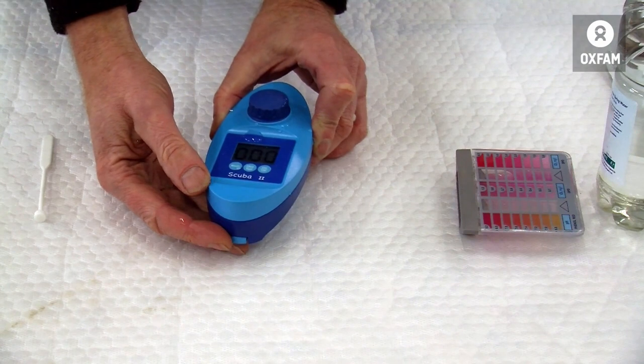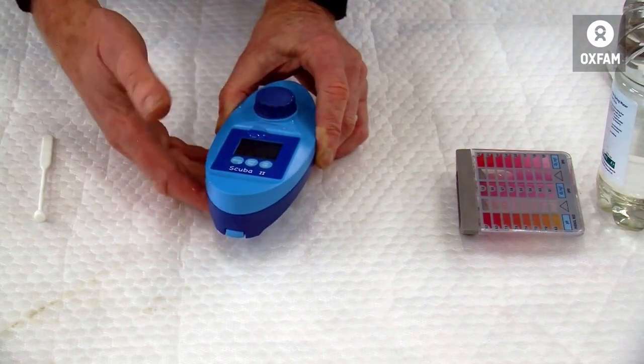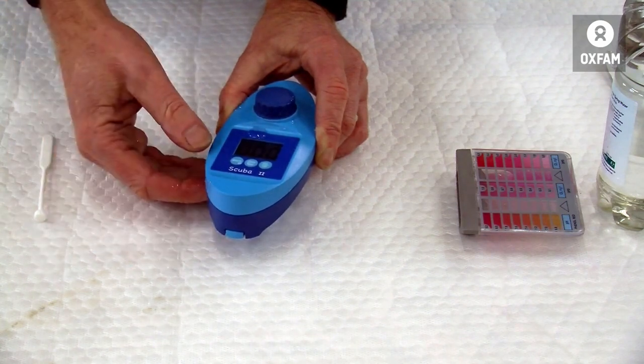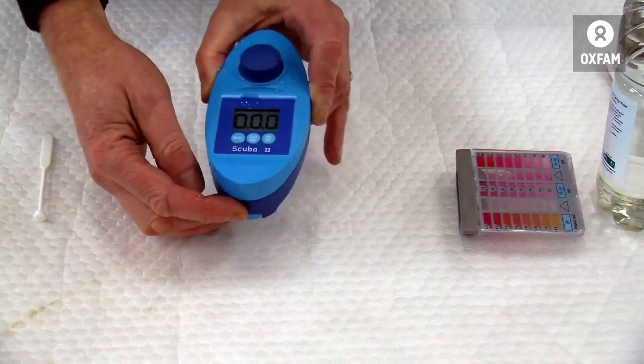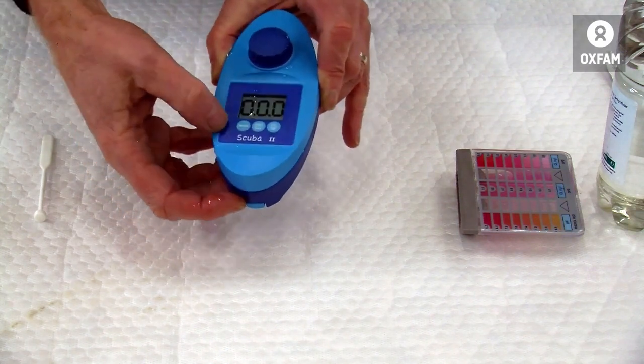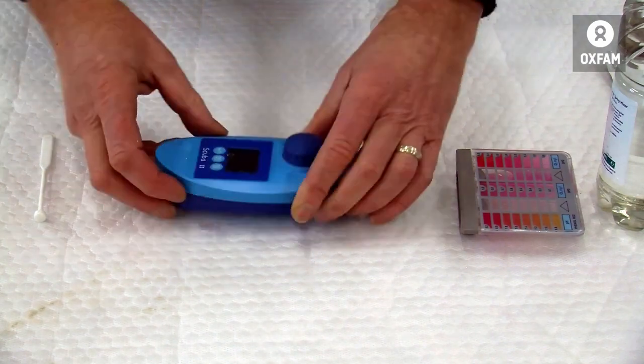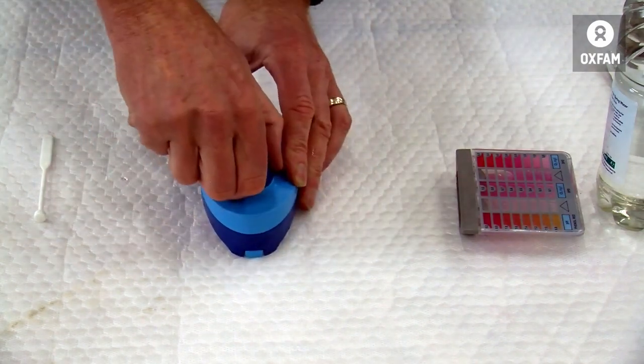It'll take a couple of seconds, so the beam of light is being passed through the water and it will read, it's recalibrating so that it knows that that is 0. When it gives that display, you know it's calibrated. I'll set the mode here. Little CL will appear there for chlorine. And then we'll add the reagent.